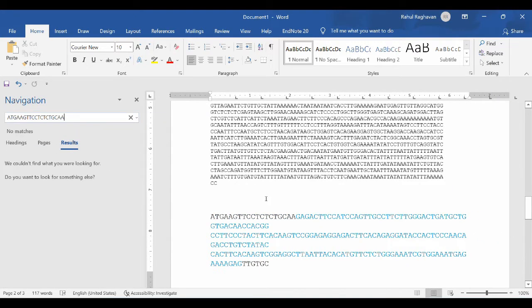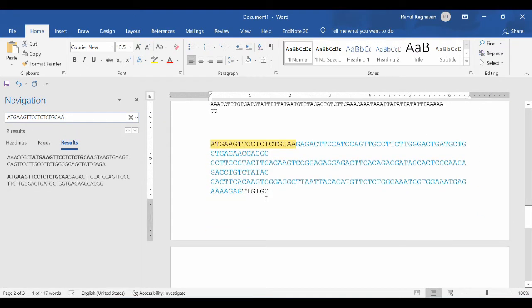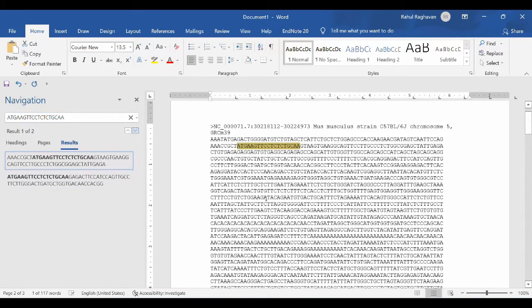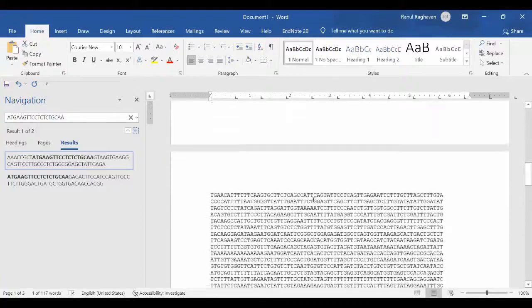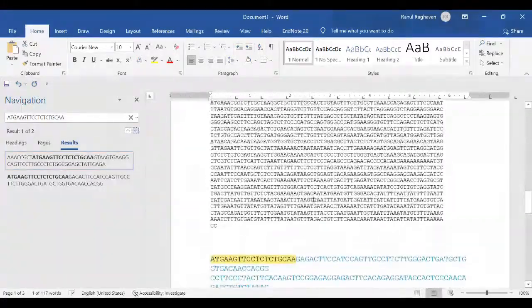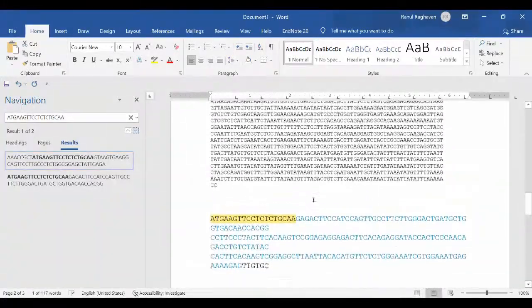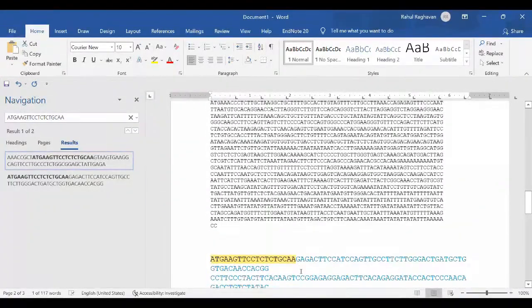The major difference is when you take the cDNA sequence from Uniprot, you will be having no intron sequence.